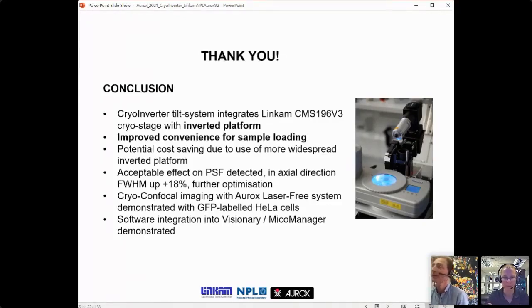So you may not see this problem all the time, but if you get condensation when you retract it, then it's no problem to dry it. Any more questions coming up in the chat? Not for the moment. Paul says thank you.